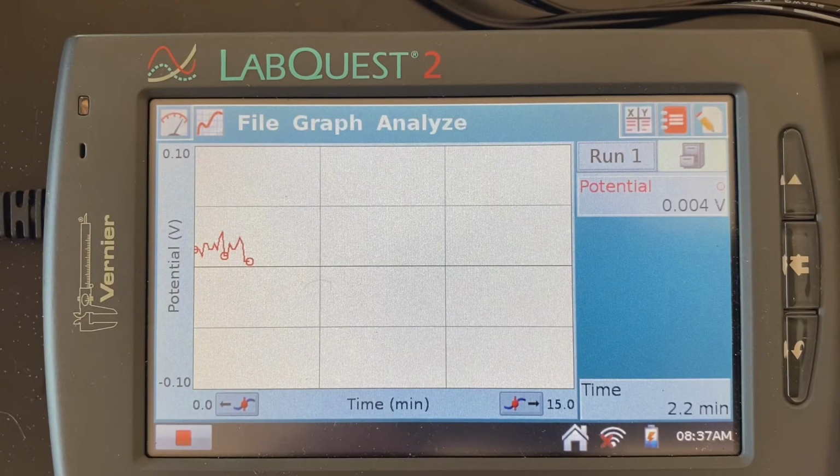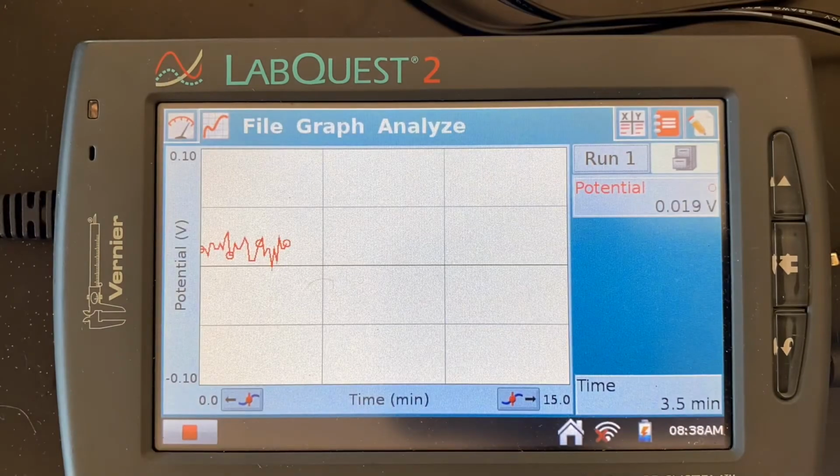Okay, so what I'm seeing here after a minute or so of running the reaction, that the electric potential inside the solution is actually going up and down periodically. Right now we just turned to a green color, and as the colors change, the electric potential of the solution is actually changing and going up and down with it. There are several redox reactions that are happening in this beaker, and they happen periodically.